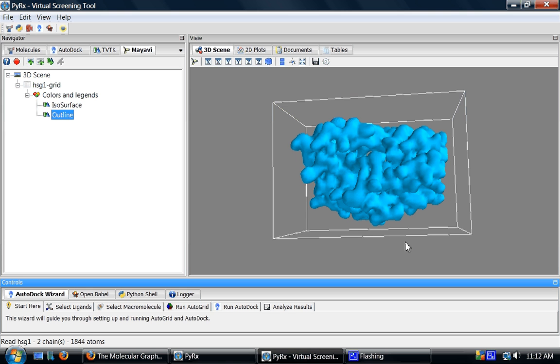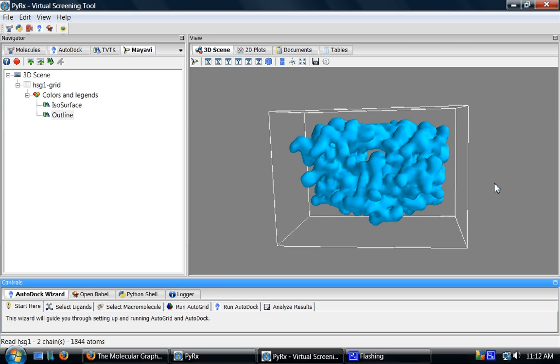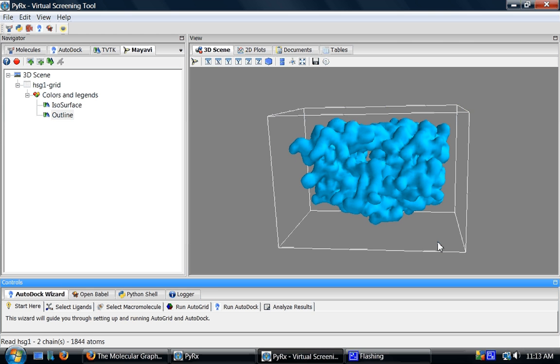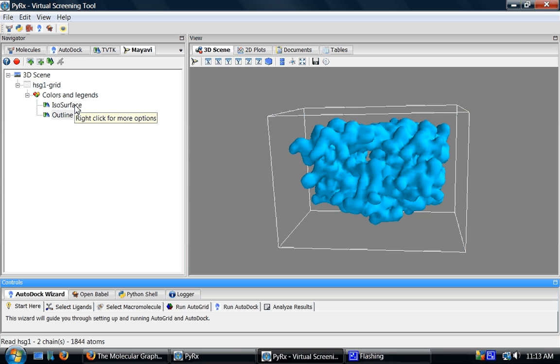So the way I compute the surface is I first compute a scalar function on this grid. I then use isosurface module to compute the isosurface that gives me this molecular surface.